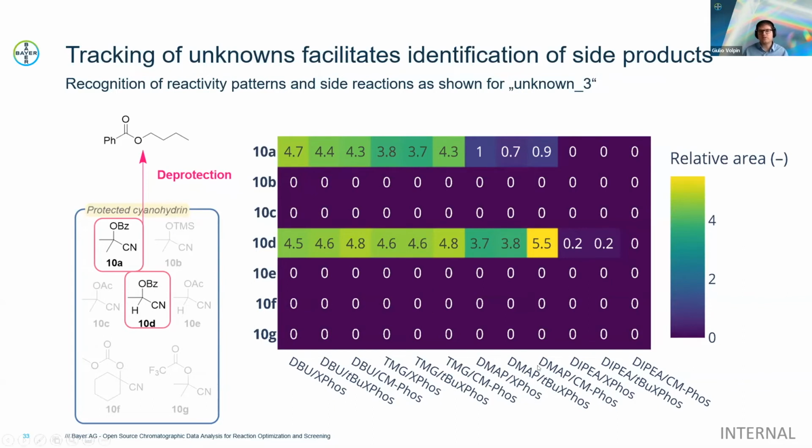And moving on to the next type of study that we did to test our software was how could we really integrate this in a fully autonomous decision-making process. So by taking the information that MOCCA provides and feeding it into an algorithm that would, based on this information that is fed to it, generate a new experimental design to optimize a reaction.